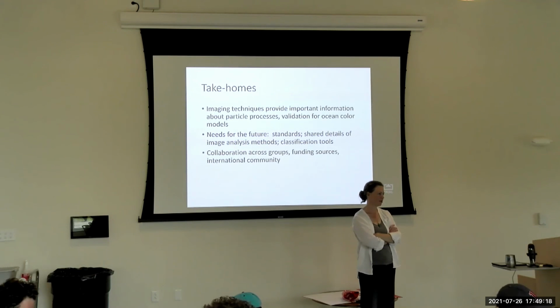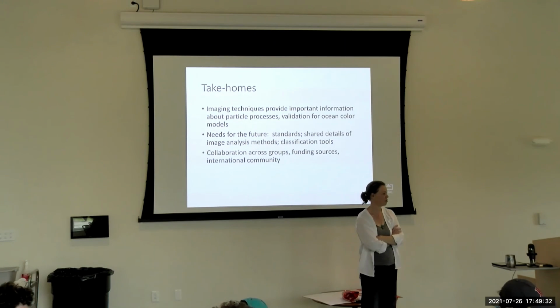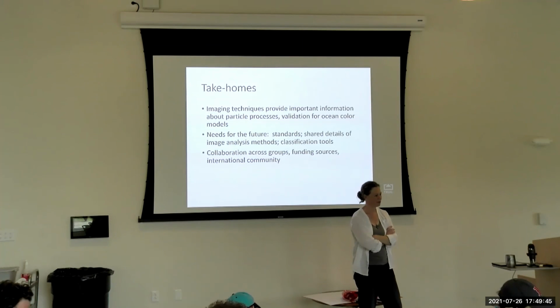All of that information is now going to be available to us, which is pretty exciting. We'll have all the FlowCam data, all the IFCB data, any microscope data, any imaging data in a single space. So you can go out and run an algorithm, say to find diatoms from your data with my algorithm, and then validate it by going into the databases, not just your own, and identifying how many diatoms were in fact in the sample.